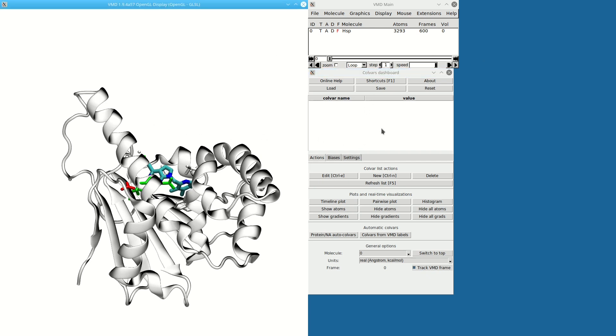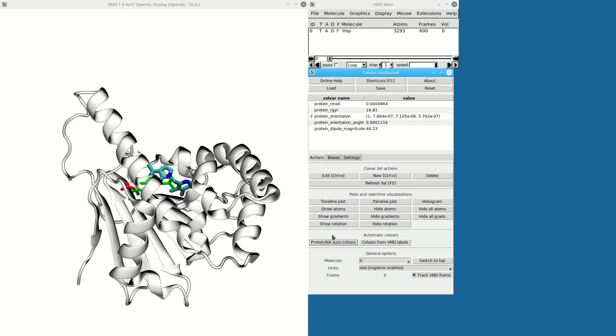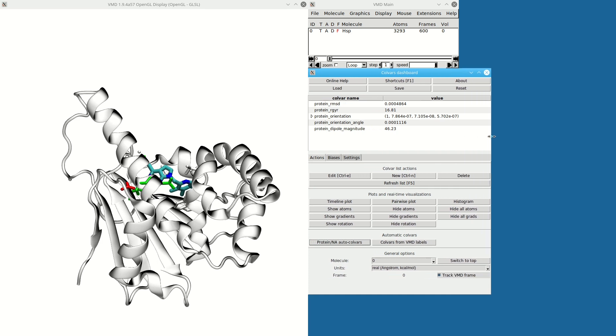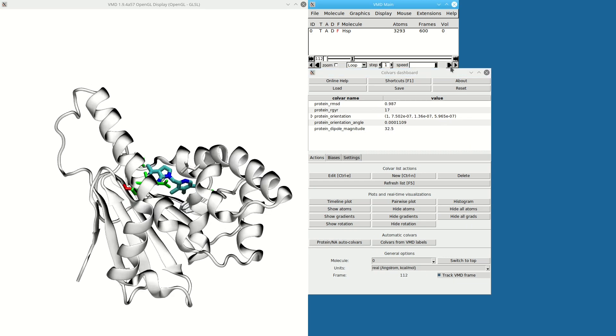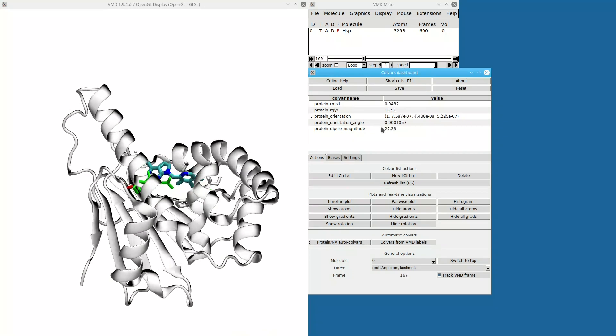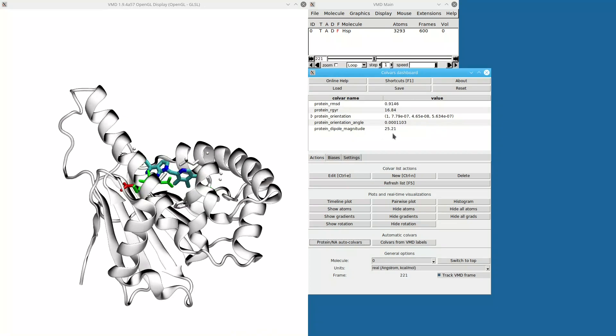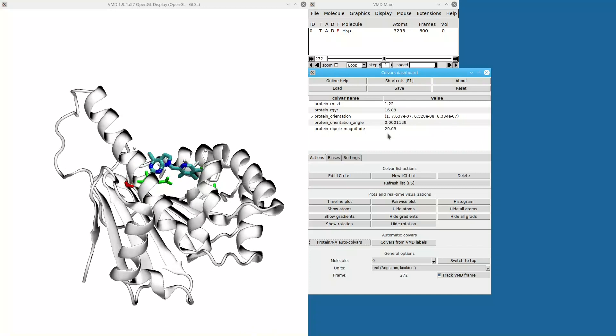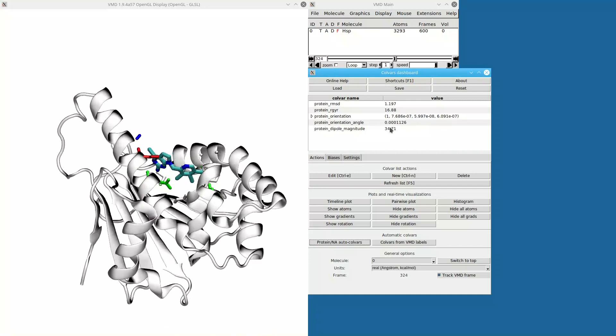This is where the Colvars are going to go. To create them, I start with automatic Colvars. These are just a set of predefined protein descriptors like RMSD and radius of gyration. The values are here, and if I animate the trajectory, you can see that the values are updated in real time—they're recomputed for every frame in the trajectory.